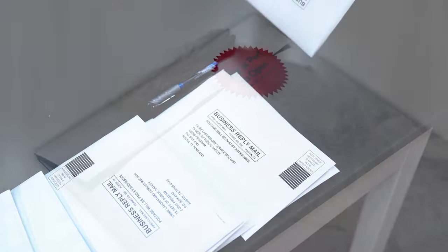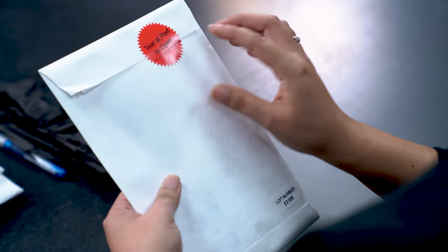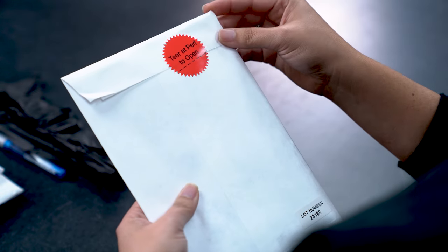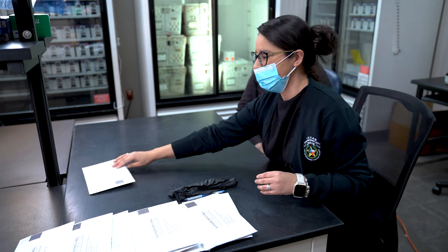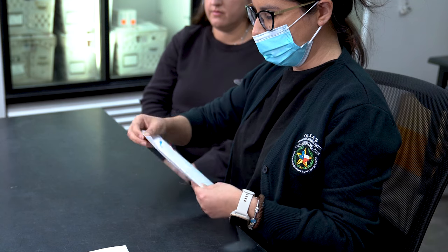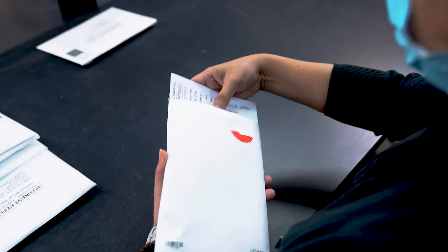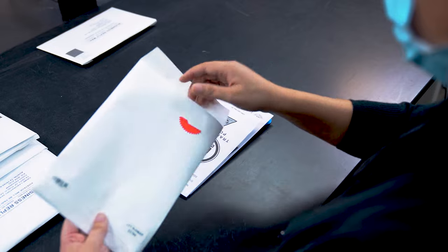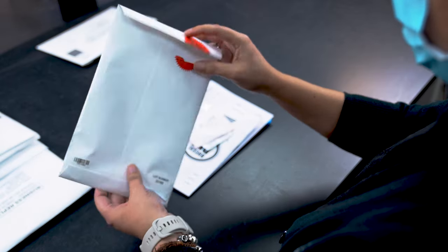Each collection kit will arrive sealed, ensuring that the contents have not been tampered with. Before using a kit, check to see that the seal is intact. If the seal is not intact, discard it and use a new kit. Break the tamper-proof seal on the kit, open the envelope, and lay the contents out on your work area. Do not discard the outer envelope as it will be reused to submit the sample to the laboratory.